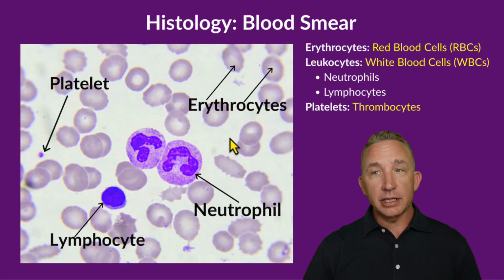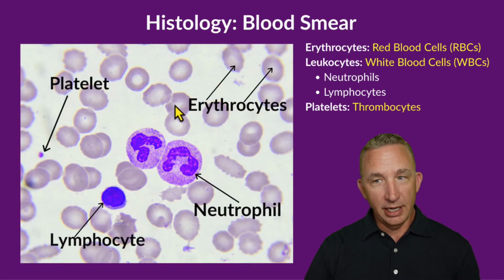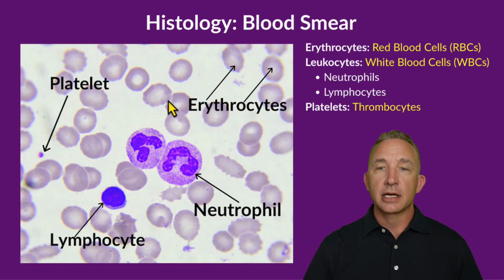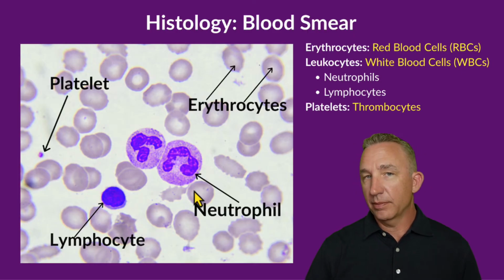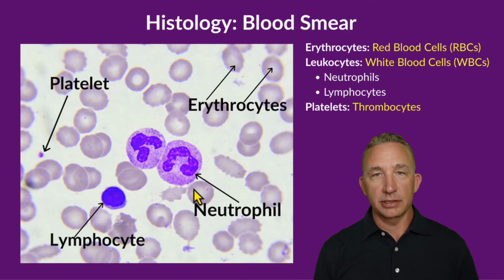And red blood cells are important for providing oxygen to the cells and tissues in the body, right? So as we look at a blood slide, all of these pink donuts are erythrocytes, and sometimes it shows that concave nature of it to provide that surface area for the affinity of the gases. But all of these pink donuts are my red blood cells or erythrocytes. And then I have neutrophils. Neutrophils account for about 50 to 70% of all of your leukocytes, which are your white blood cells.